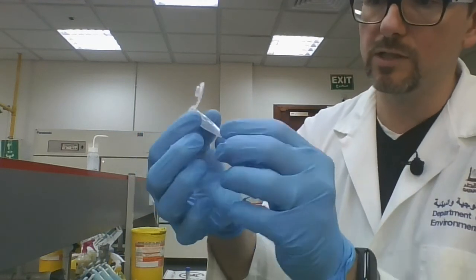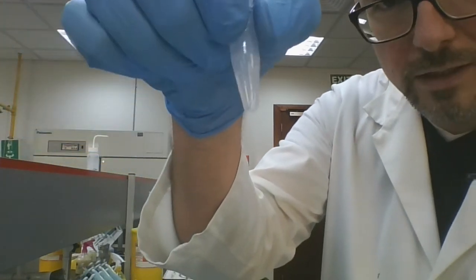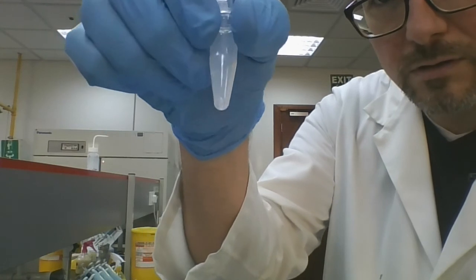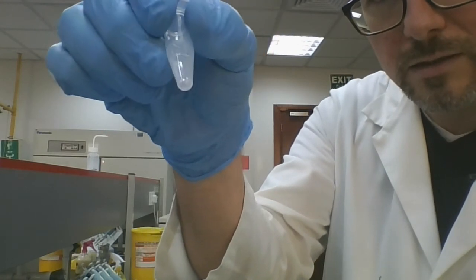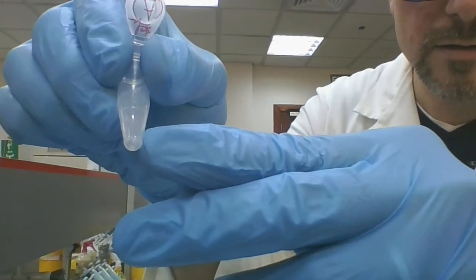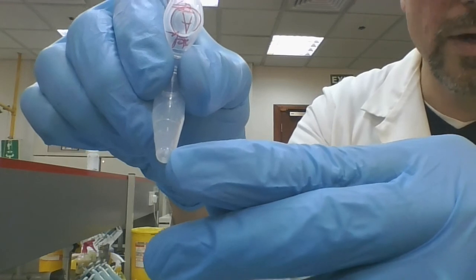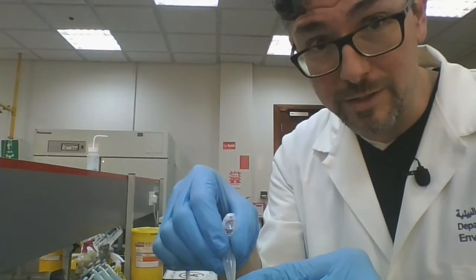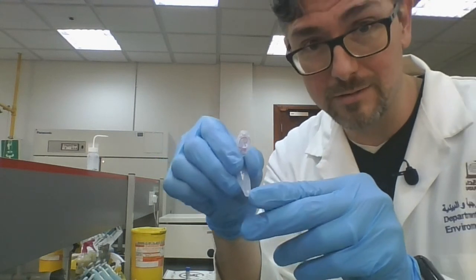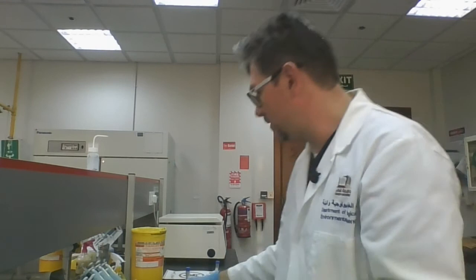And so what you have is a relatively dry tube that has very little liquid, or almost no liquid. And now if you look carefully, you should hopefully see that there is in fact a small white pellet at the very bottom of this tube right there. Again, why is it so small? Because it's molecular biology. We're dealing with molecules. The fact that you're seeing anything at all means you have a large pellet. So don't let the size of the pellet fool you. There's a lot of DNA in here. Let's do the same thing with the other one.